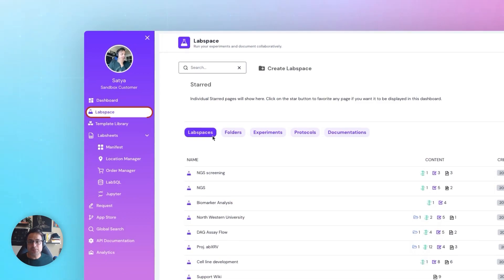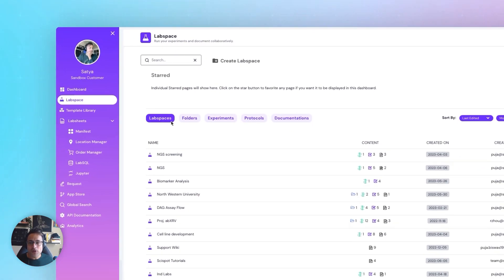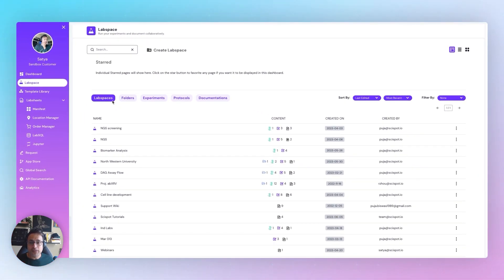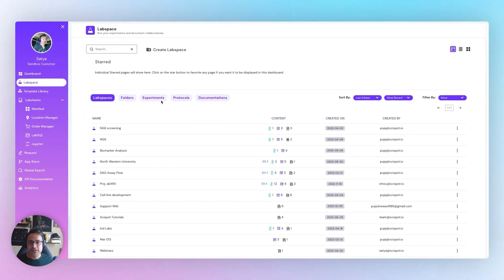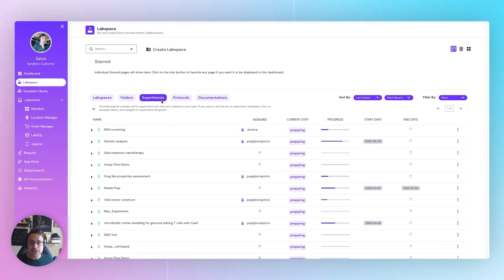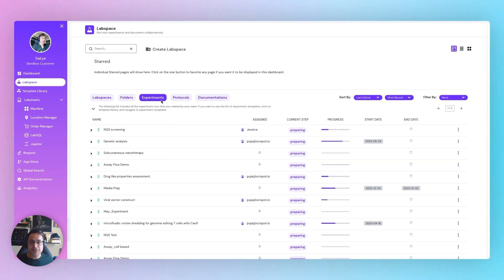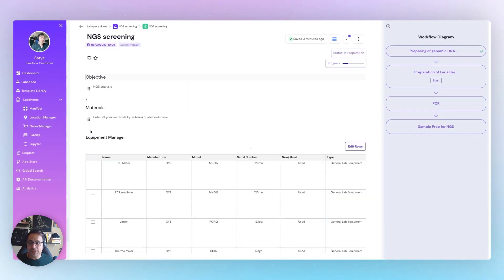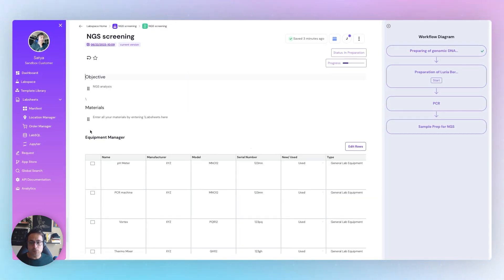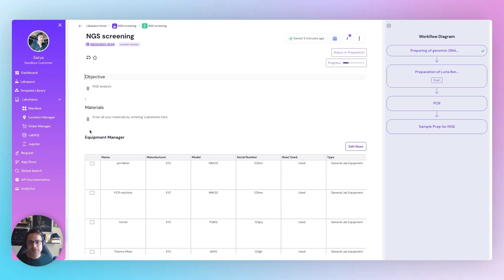At its heart is LabSpace, a modern notebook with built-in project management functionalities. No more juggling between different systems and softwares. Everything you need in one spot.